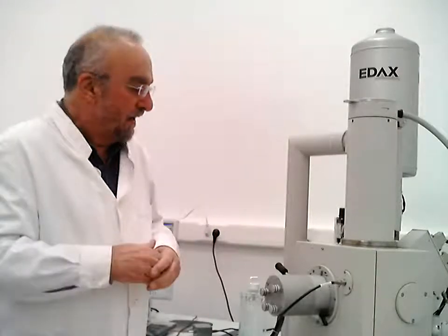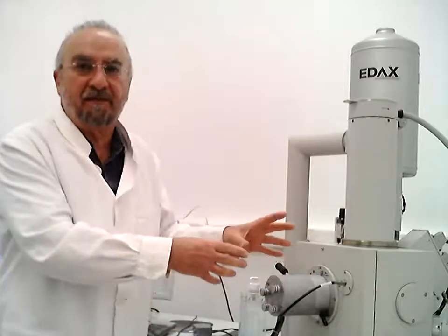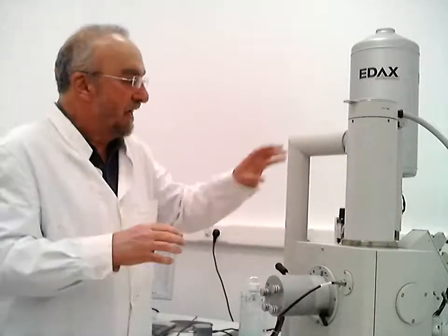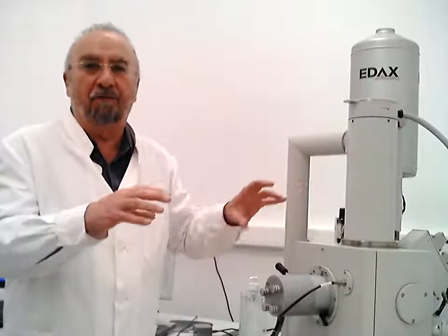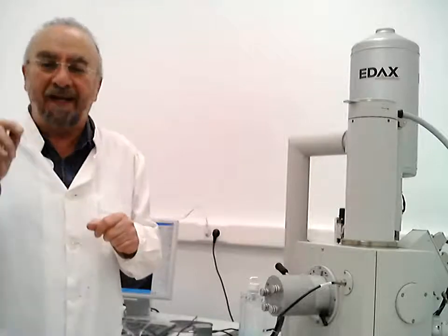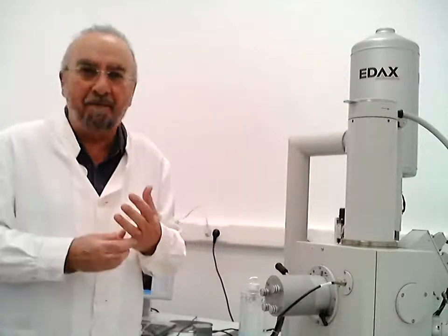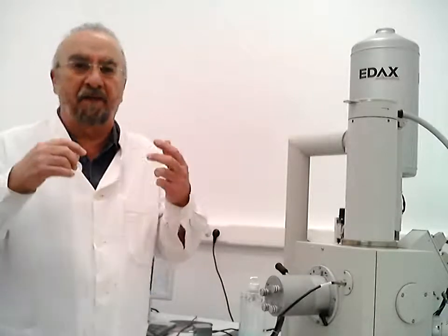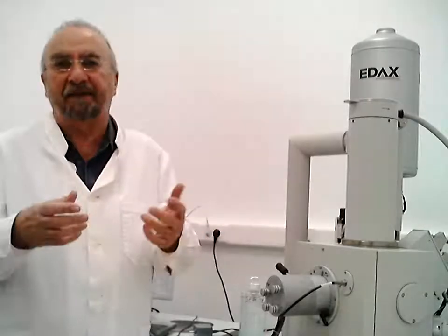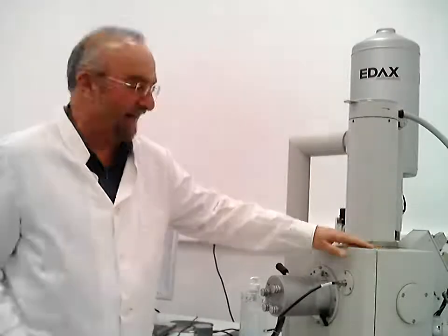So the materials over here, I've got about 4 specimens in here, and I will show you how they look in the electron microscope. When we are playing with the electron microscope, we can see tiny details, but more importantly, we can analyze what we see. We can analyze the elements that they contain, whether they're oxidized, or if they're metals, if they are organic materials. We can analyze lots of things. This is one of our right-hand tools, let's say. It's a very important tool.